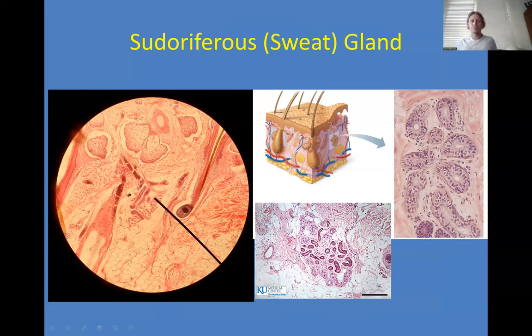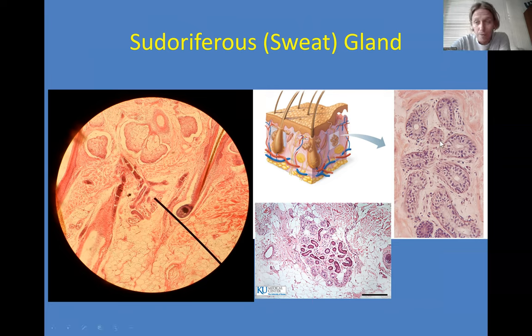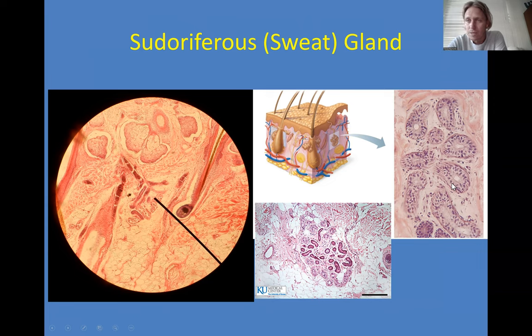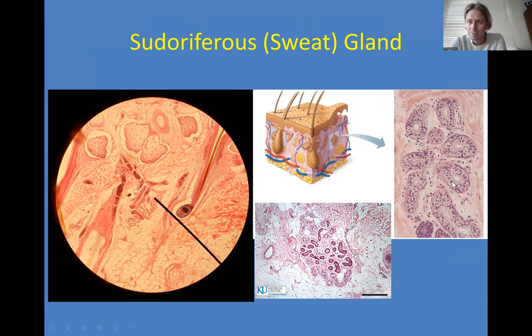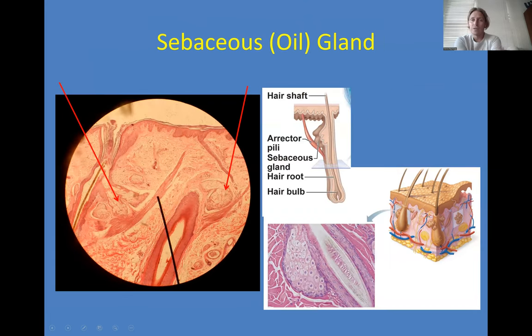Please use the proper anatomical term — sudoriferous, not sweat glands. Try to identify the type of cells. If you look closely, this is actually simple cuboidal epithelium. Here's the lumen of the tube and the basement membrane surrounding it. It's a little hard to see because getting a clean cut of this tissue is difficult, but this is simple cuboidal epithelium.